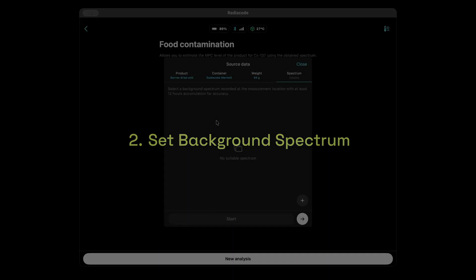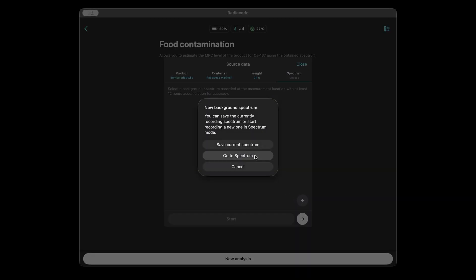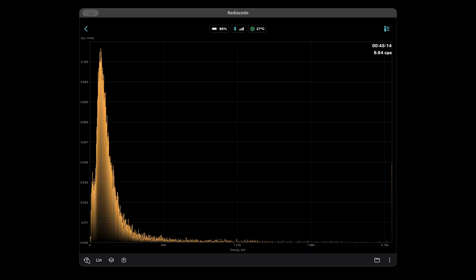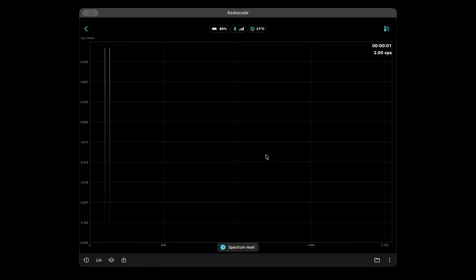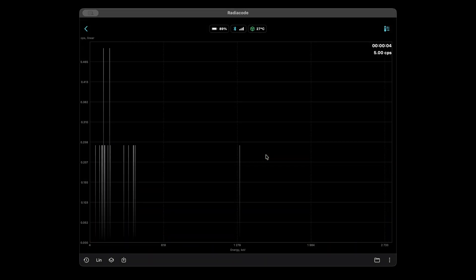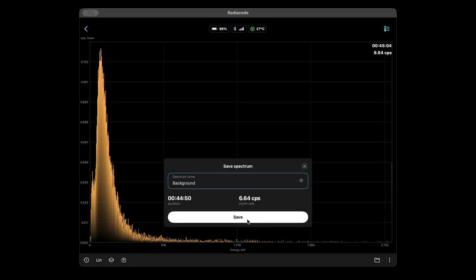Step 2: Set up the background spectrum. This step ensures the detector subtracts the natural radiation background automatically. You only need to do this once — the spectrum can be saved and reused later. To create a background spectrum, in the menu press plus, switch to spectrum mode, and reset any old spectrum. Leave the detector running for 24 hours — 48 hours is better. Save the result under a name like "background."